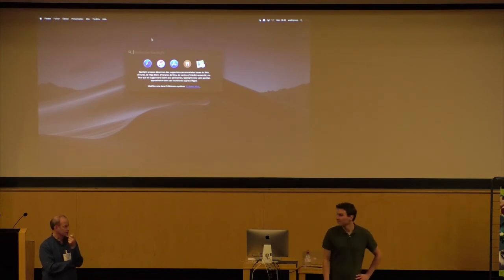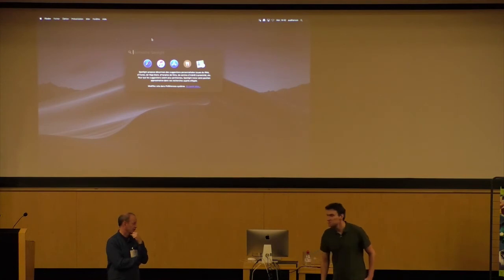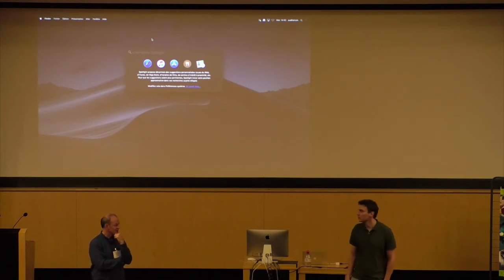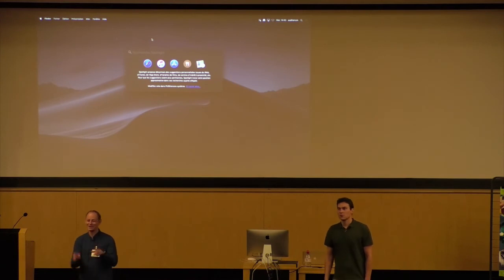Have you thought of combining that maybe with fluorescent markers to identify, if you take a lysate, you could also start directly with your complex? We were thinking about this, but it's quite new, this electrophoresis thing. It was developed in the last half year. That's interesting to use with small volumes also.